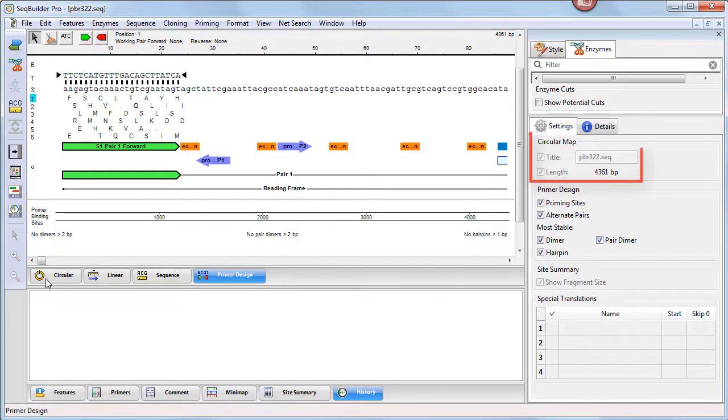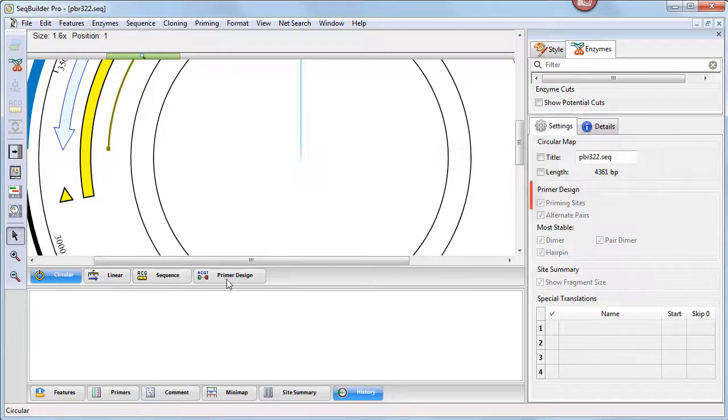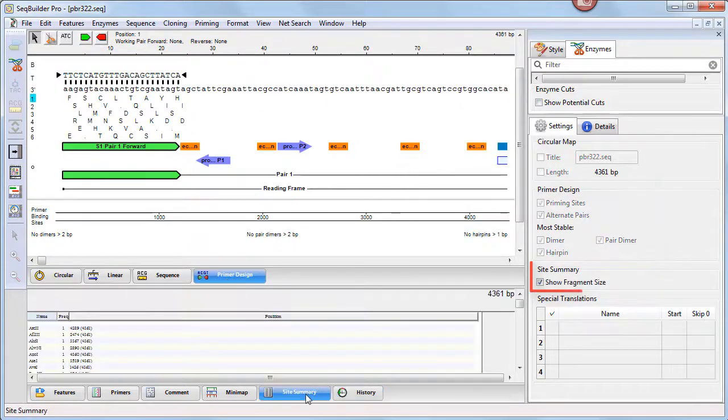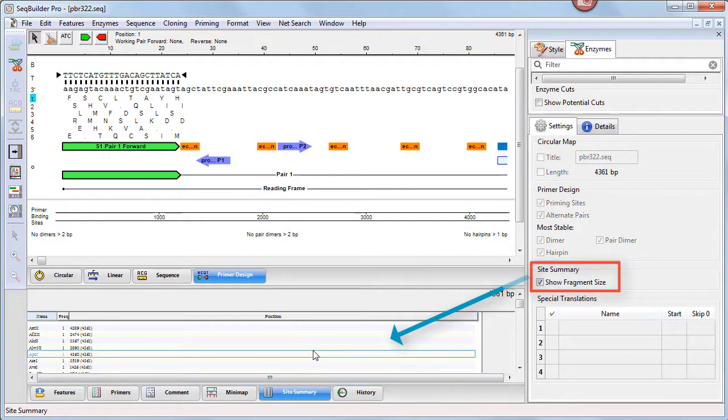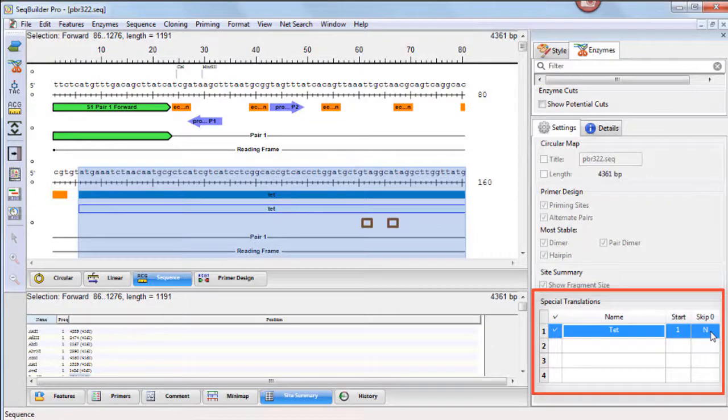For example, the circular map view, the primer design view, or the site summary view. An editable table at the bottom of this panel shows information about portions of sequence that have been translated according to user specifications.